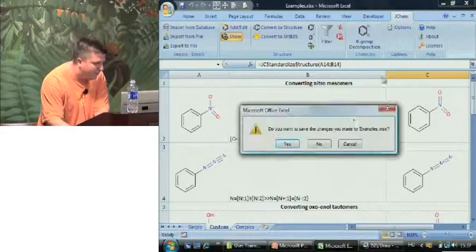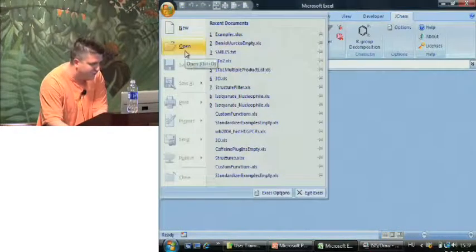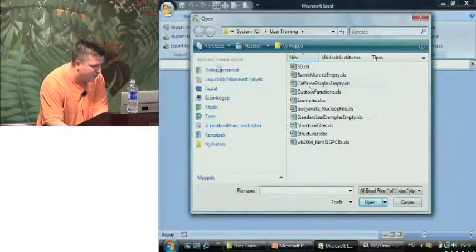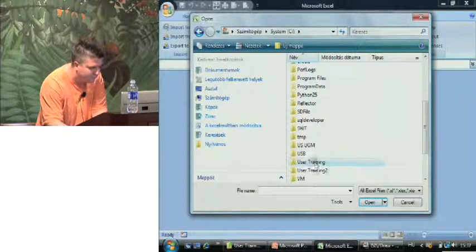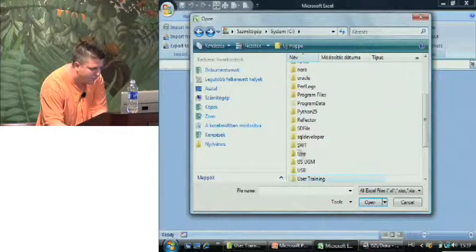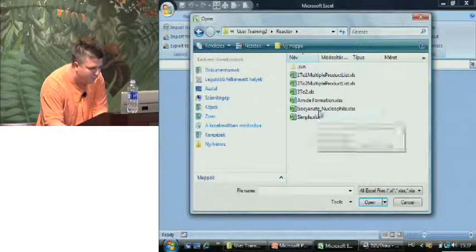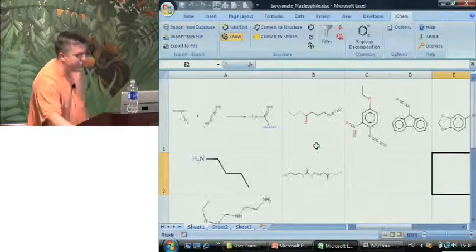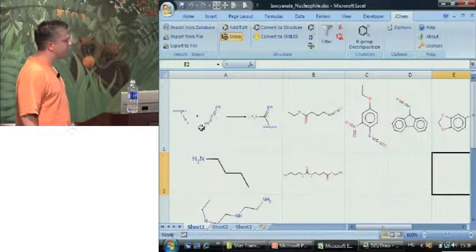And finally, the most interesting part for the use of these functions, actually, we implemented the Reactor functionality inside JChem for Excel. So what you can see here, basically, we have a reaction or generic reaction or reaction template.